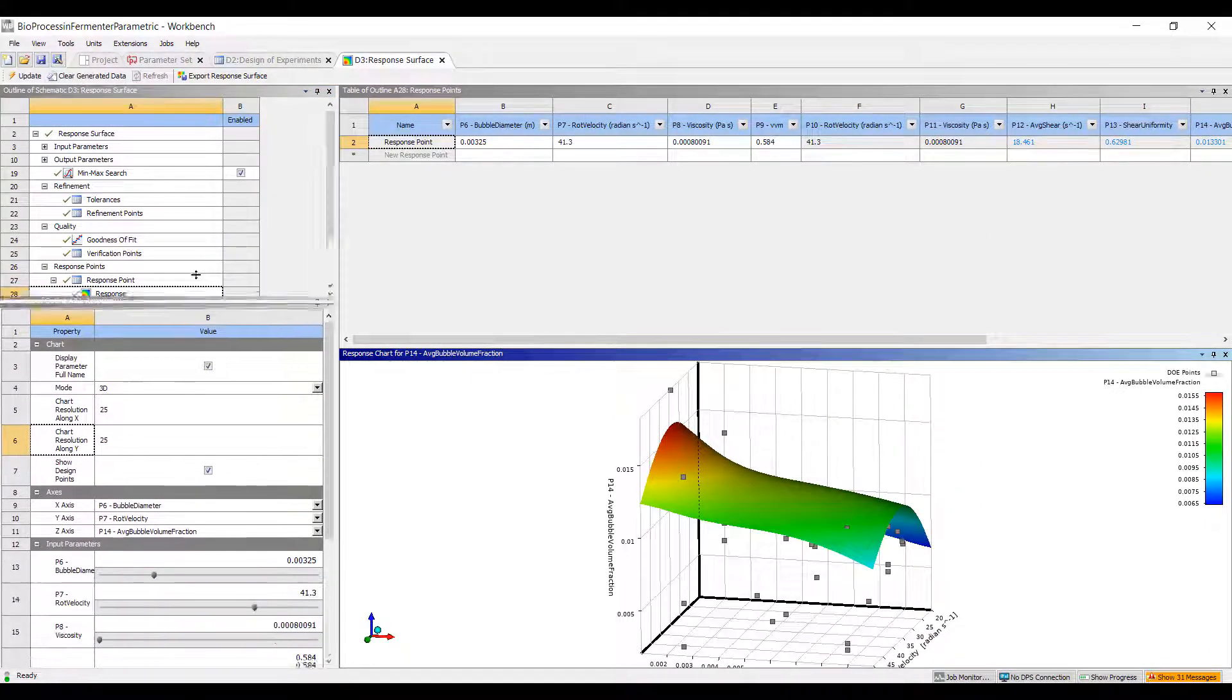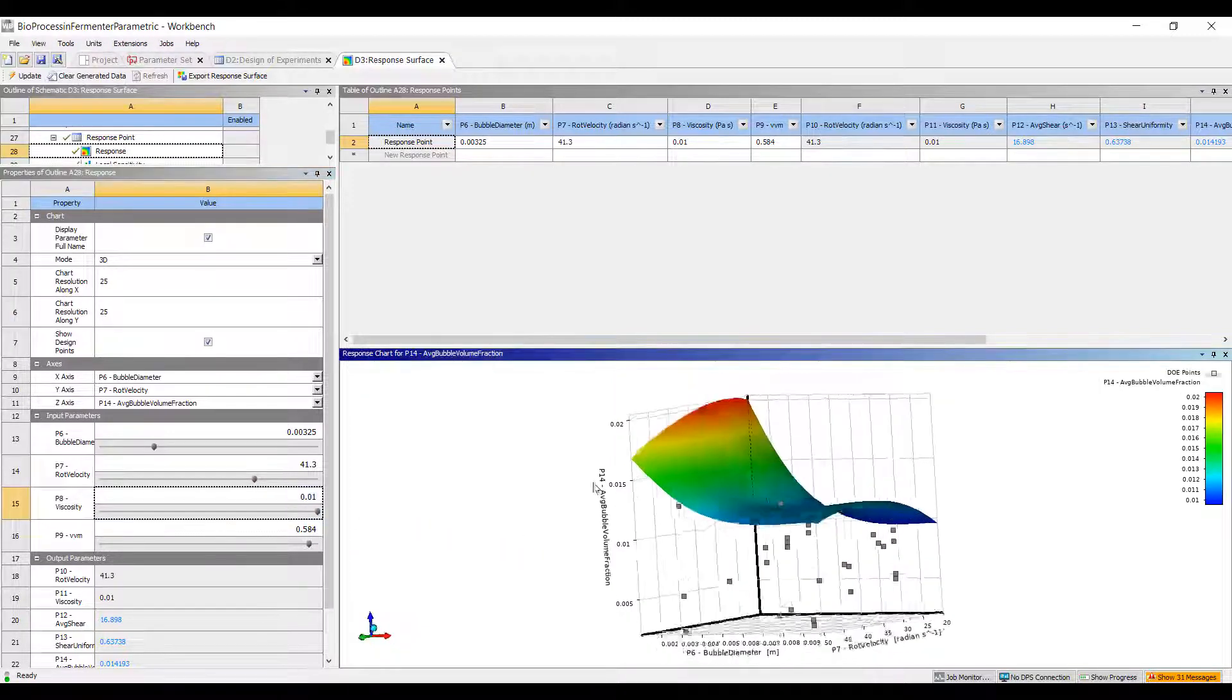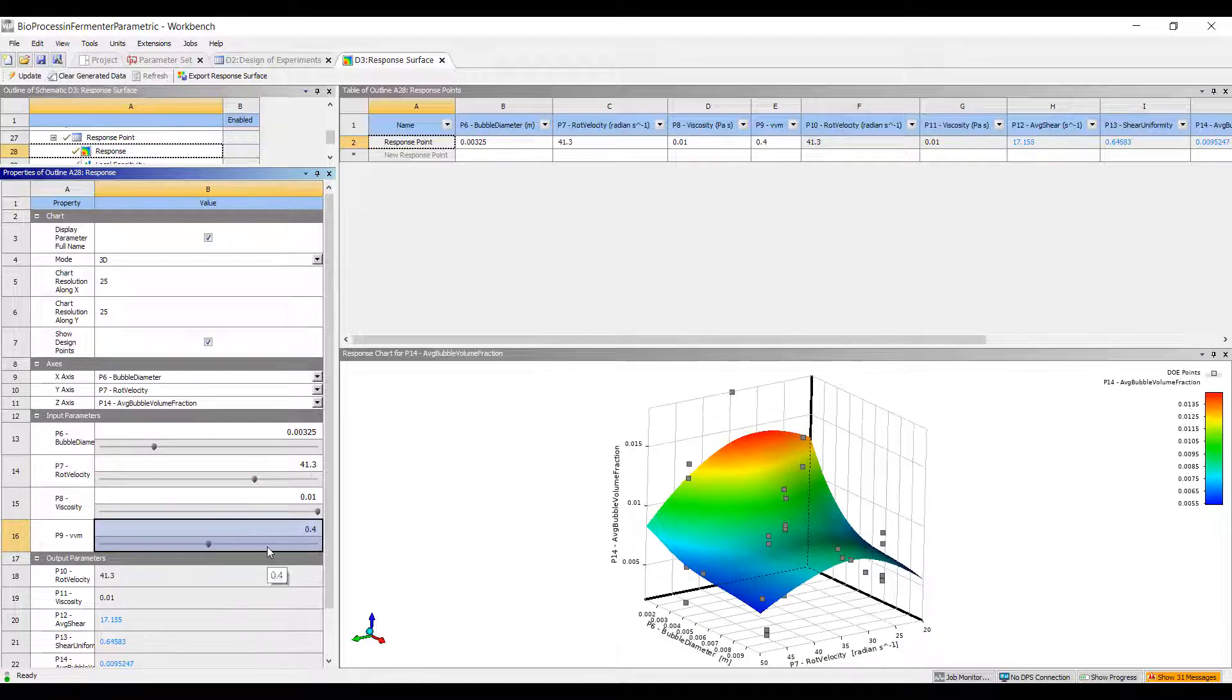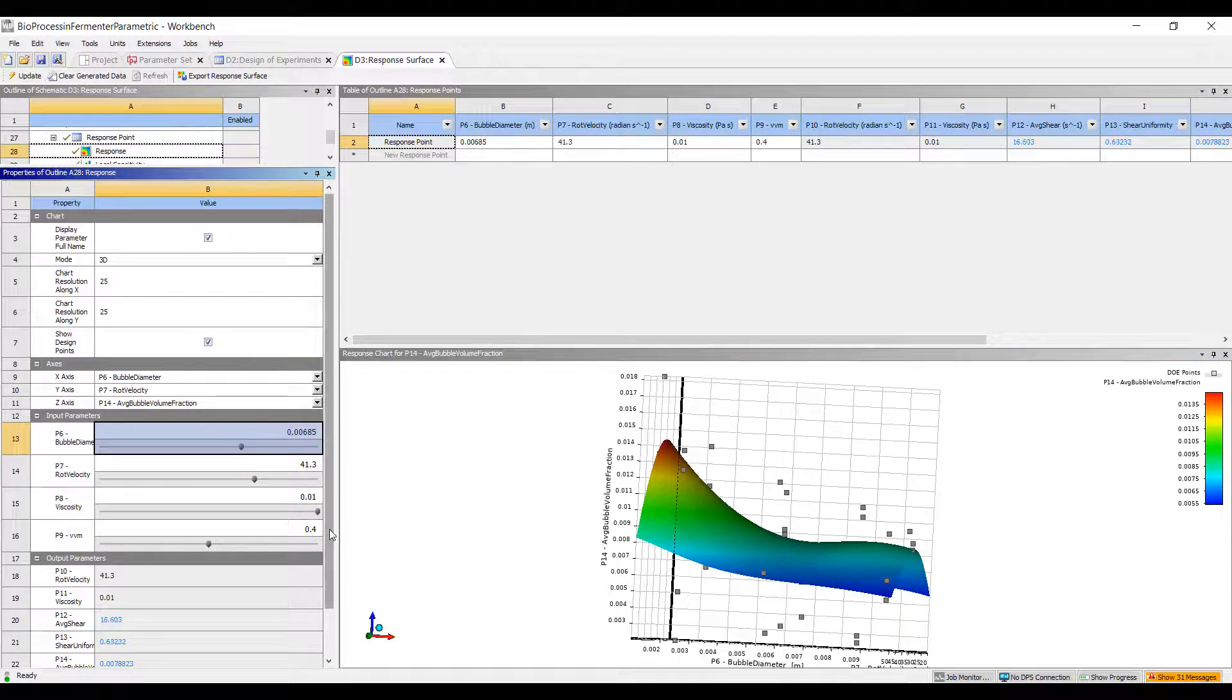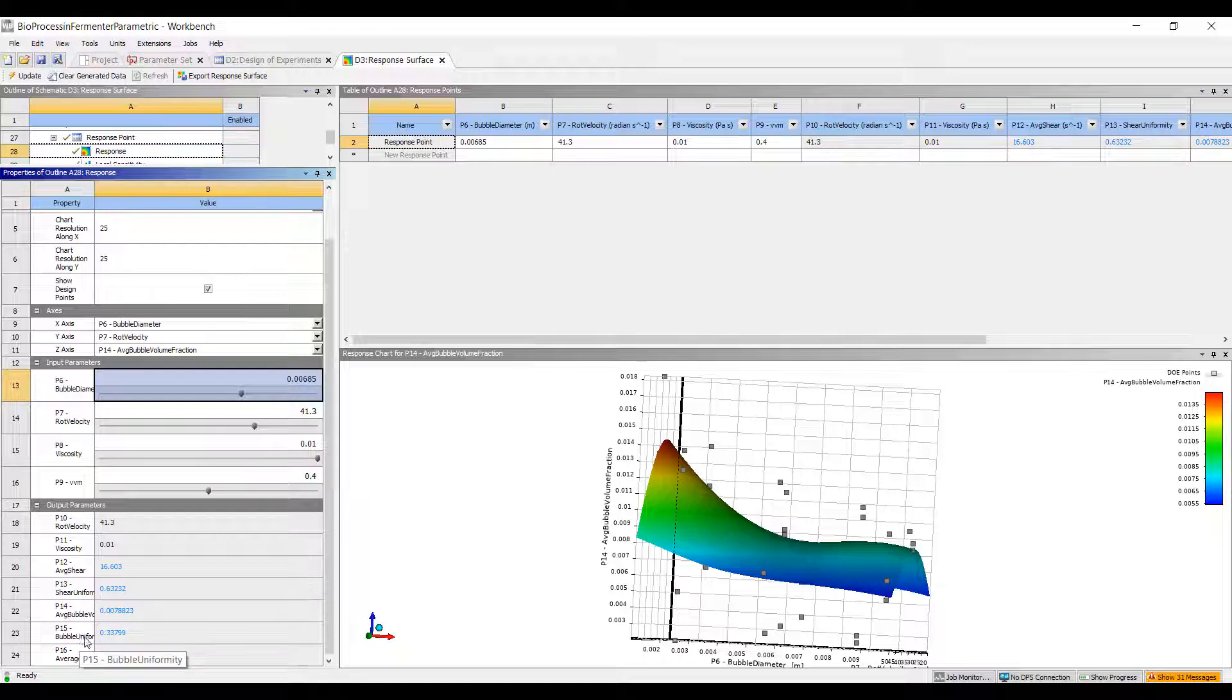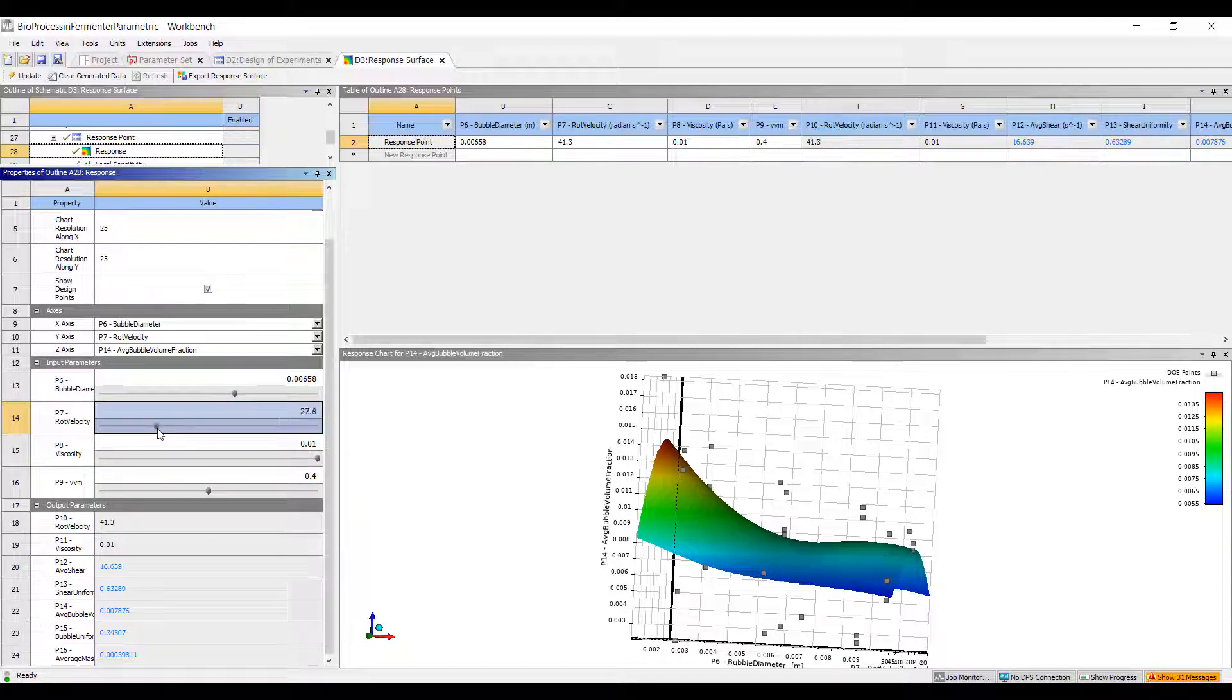This is a response surface. What's really nice about this is that we have the ability to tune our simulation. I have four input parameters. I can say, okay, this is water right now. What happens if I make this kind in the consistency of motor oil, if I have a very viscous fluid? And I decided to flow 0.4 VVM of gas through my system. Then I can try different bubble diameters. You can see that as I change these, the response surface tries to predict what my shear average and uniformity of the shear, my bubble volume fraction and uniformity of the bubbles, and then also my average mass transfer coefficient.